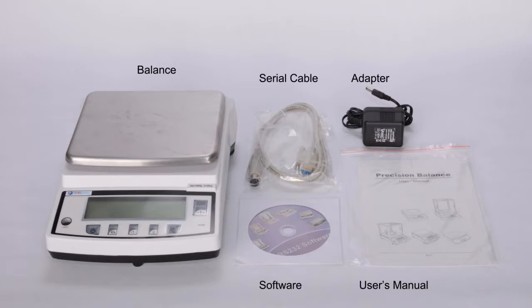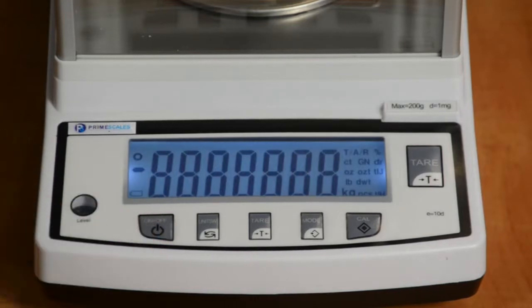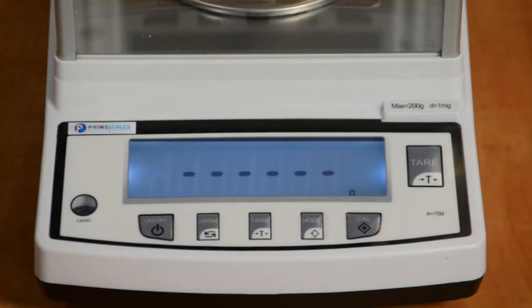The standard accessories with the Type B series include a power adapter, free application software for a PC, serial cable for a PC, and a user's manual. In this video, we will show you the basic setup, calibration, and testing for both Type A and Type B scales.